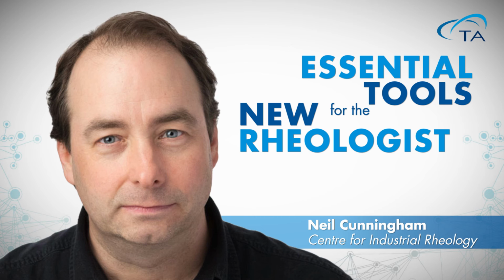Okay. Yeah, great. I think that was a great answer, and shared a lot of insight. So one specific question, and I think a question that I often hear from people trying to understand the right experimental protocol to solve the answer they're interested in, is about the yield stress. There are several methods that may be bandied about in the community as to how you might measure the yield stress, but can you give any recommendation or insight into the different methods, or specifically, is there one best method for measuring the yield stress of a material?